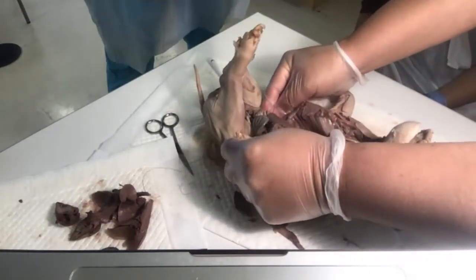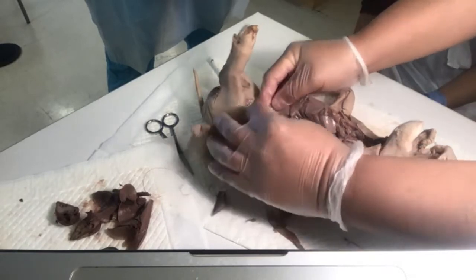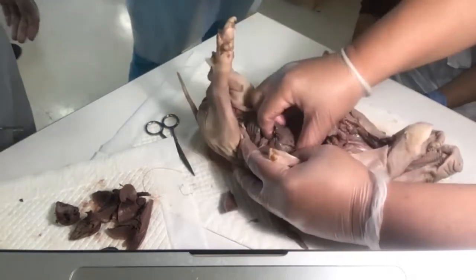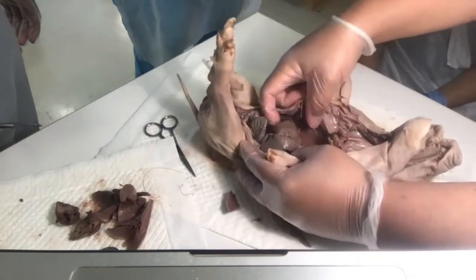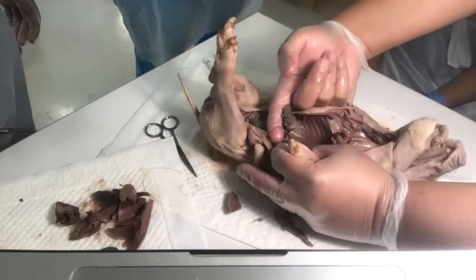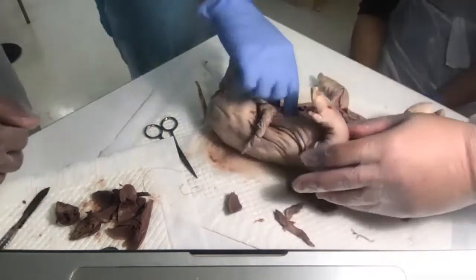So who's next? Who's going to be the surgeon? Who's next? Eeny, meeny, miny, mo. You're picking up the scalpel. So you're next. The next thing you're going to do is take out this thing, and this is the liver. It's got shot up a little bit because we cut it up a little bit. But once we take that out, everyone see here? Feel this. That's your falciform ligament.